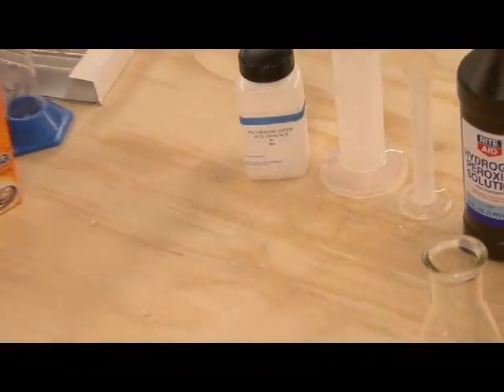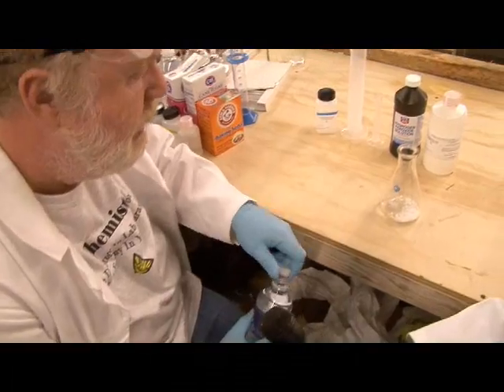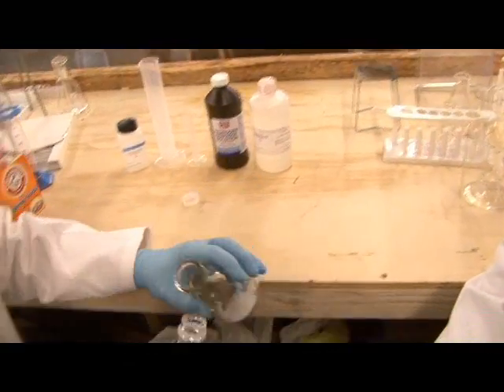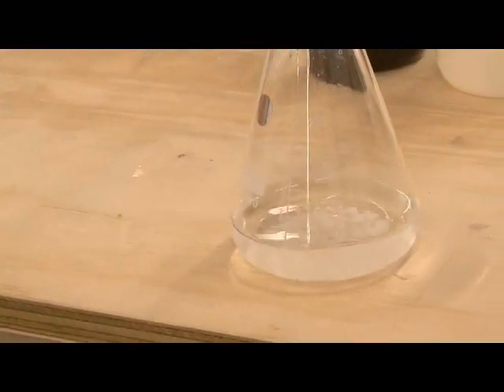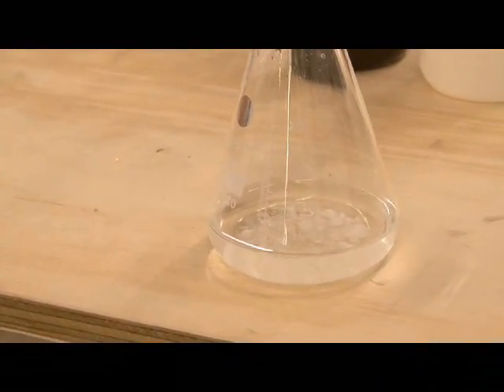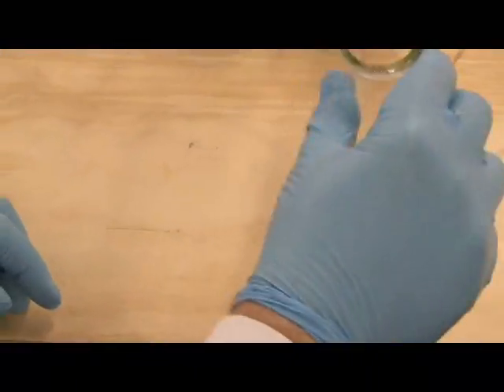Let me go ahead and add a little bit of water. Potassium iodide is very soluble — 100 grams of water actually dissolves more than 100 grams of potassium iodide. It's a very soluble chemical. We put it in solution, and it is dissolved.